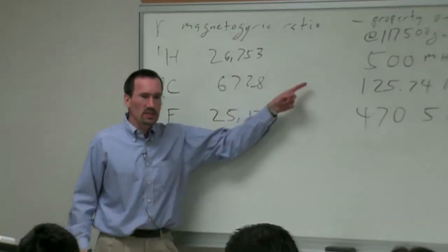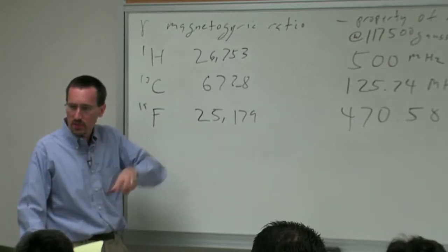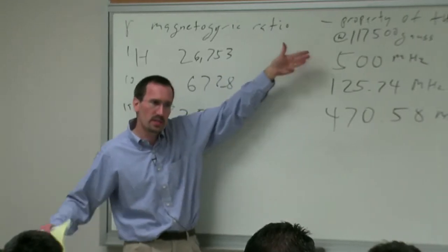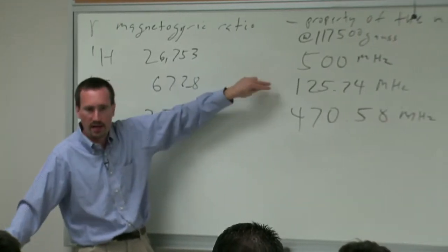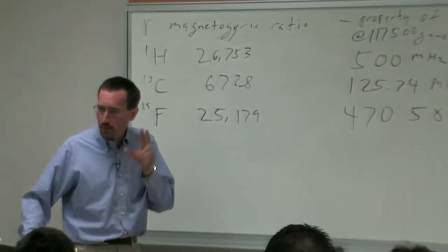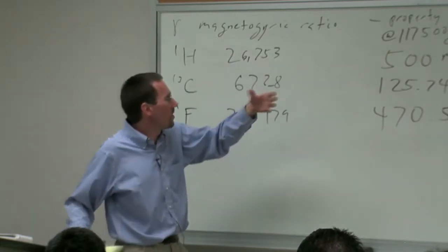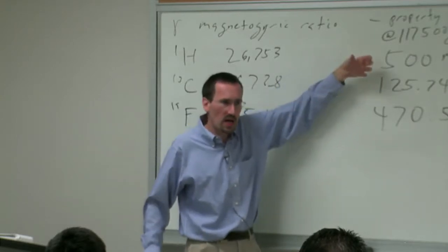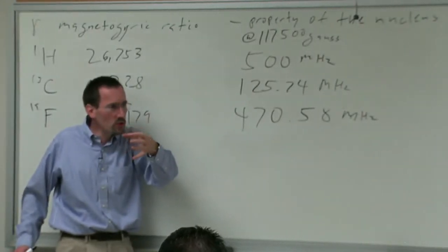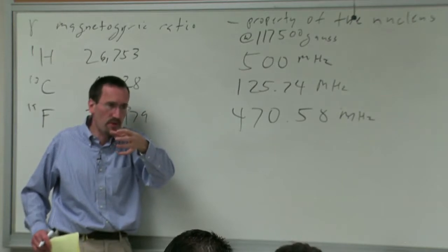Usually it takes certain types of probe technology, we'll talk more about that later, certain types of coil technology to tune to higher frequencies and certain types of coil technology to tune to lower frequencies. So often if you want a really good proton NMR, you will use a special probe where the coil that's tuned for proton is inner and close to the sample, and the coil that's tuned for other nuclei is bigger and further away from the sample.